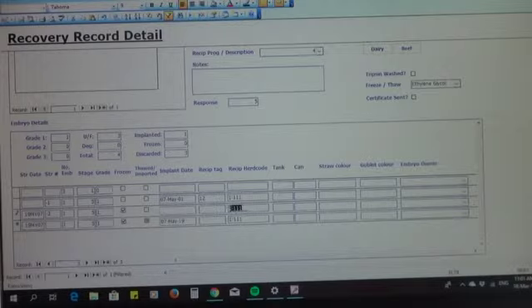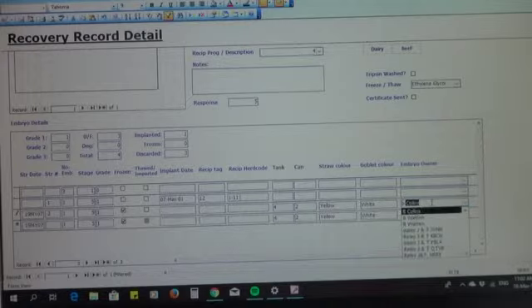So it's good that these auto-fill down, but in this case, I've put it in tank 4, canister 2, and it's yellow, white. Okay, embryo column number. I don't think I need to put that in there, but I should.